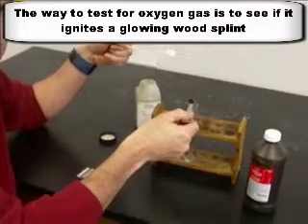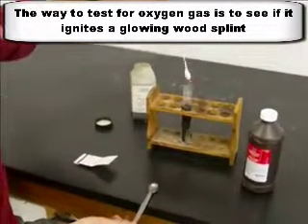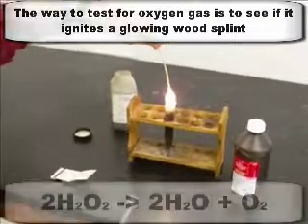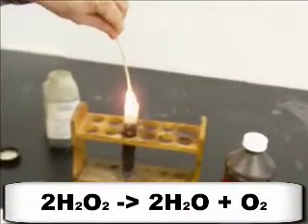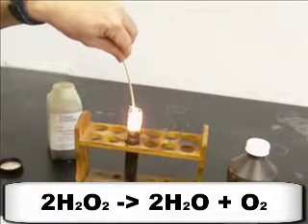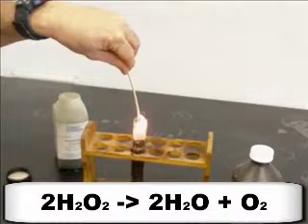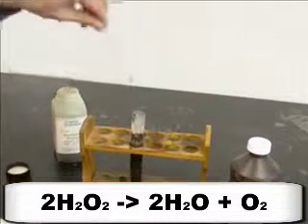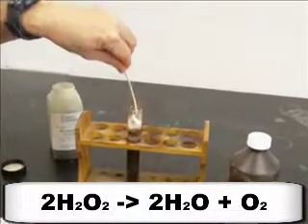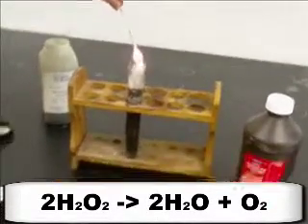So I'm going to add this. This should produce oxygen gas. And then watch what happens when I put this in here. See how it lights up much brighter? That's because we are producing O2 gas. See, it stays lit even when I put it in there because it's producing this oxygen gas. You can even blow it out and make it glow and put it in there. It'll turn back on or reignite. Hey, look at that. There you go. See how that's pretty cool? Should do it again. Because it's producing the oxygen gas.